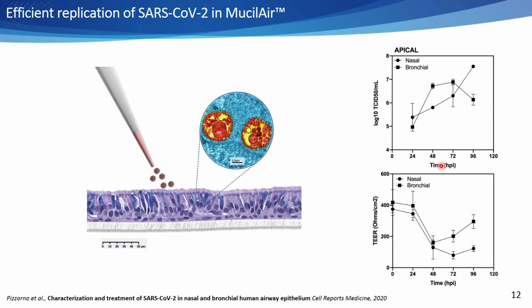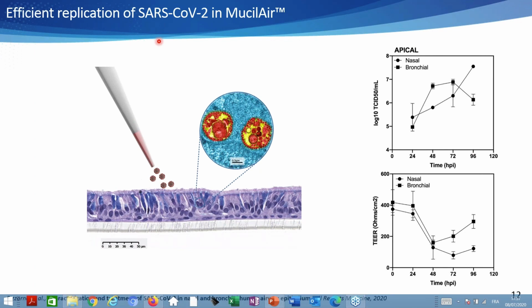But more convincing are the data reported here, where you could infect the models apically with SARS-CoV-2 and then follow the kinetic of virus growth with time.